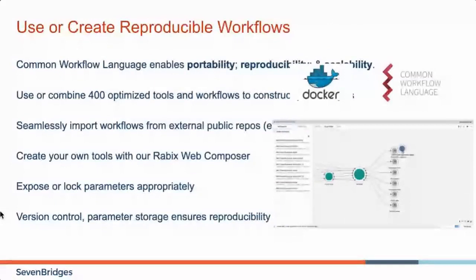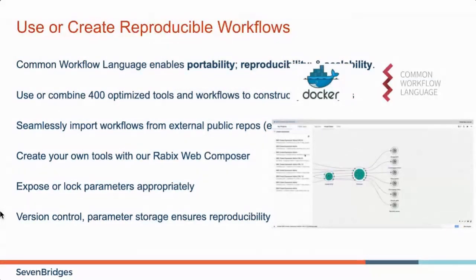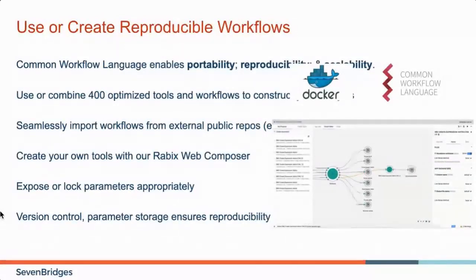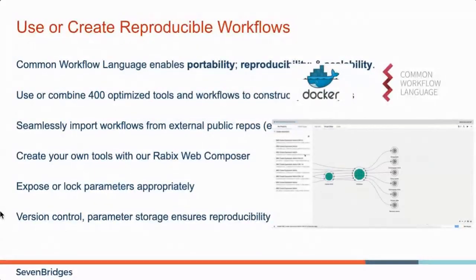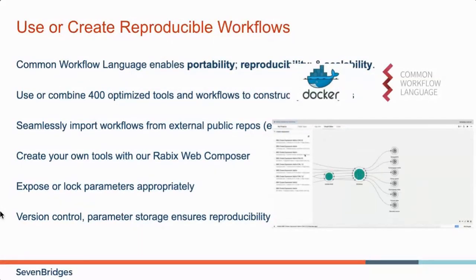We also provide a lot of ways to use different tools. So we have a public apps gallery that has over 400 different tools and workflows that allow you to put together any workflow without necessarily being expert in that particular bioinformatics method. And we cover many, many areas of analysis in our public apps gallery. All the tools on our platform are wrapped in common workflow language and use Docker containers, so they're very portable and very reproducible.